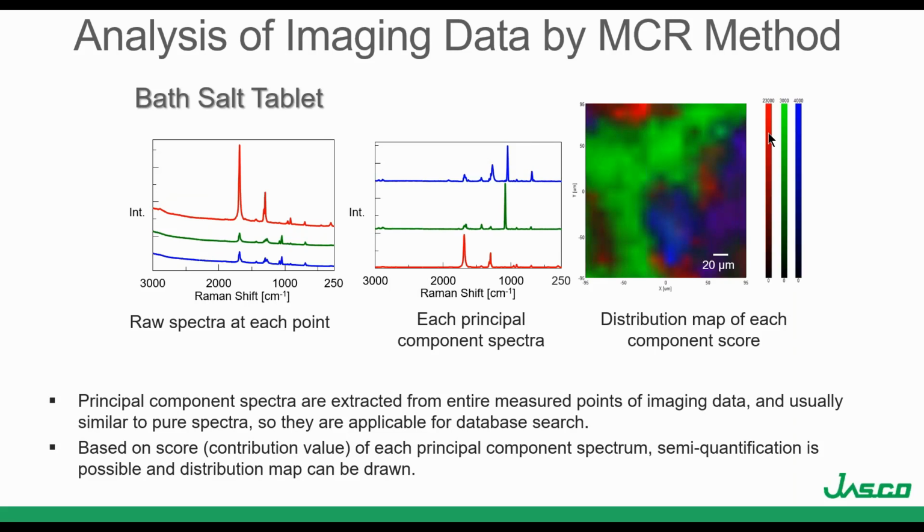With this, I just want to finish reinforcing the idea of analyzing and processing the data after the measurement. And one of the techniques is the MCR, as I mentioned before. In this measurement, the measurement was done, as I was mentioning before, creating a grid. And after that grid was created, nothing was needed to first determine that there are 3 different components, and those 3 different components can be mapped in the image.